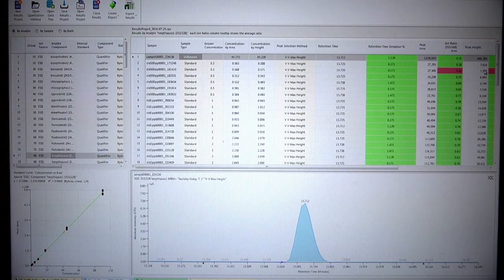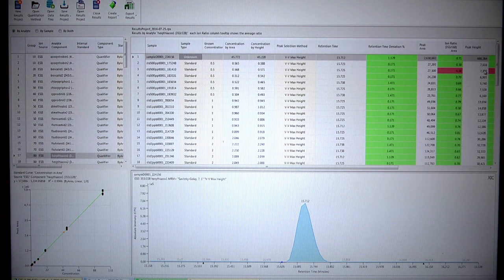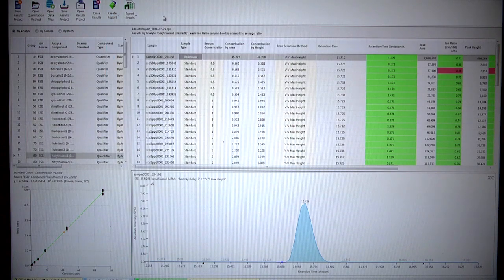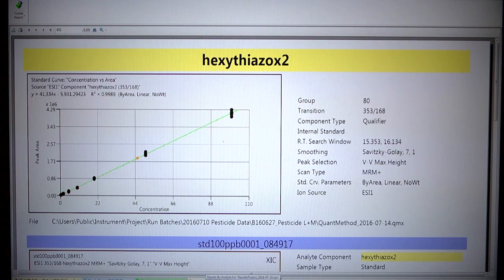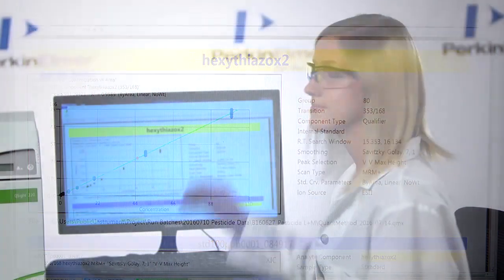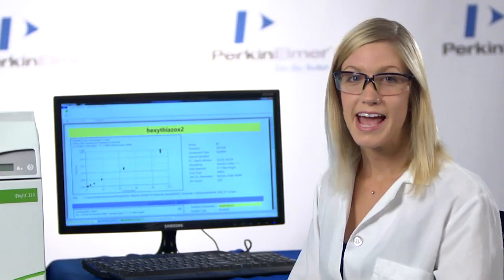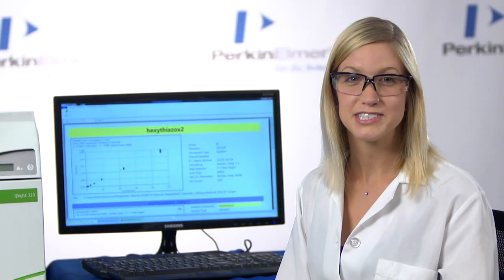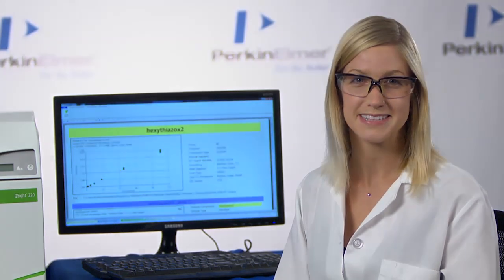Now I need to generate a report. I will use one of the pre-configured templates, but I could also build one of my own. And now my pesticide report is complete using the Q-Site 200 Series Triple Quad Instrument.